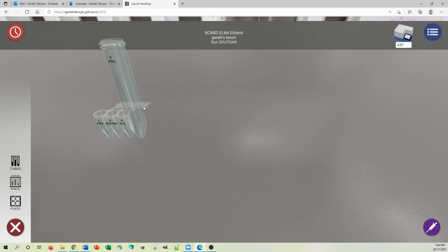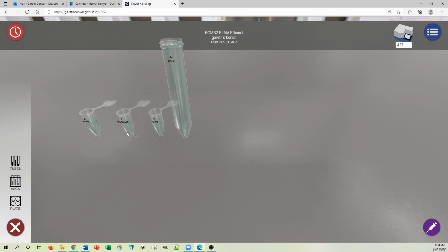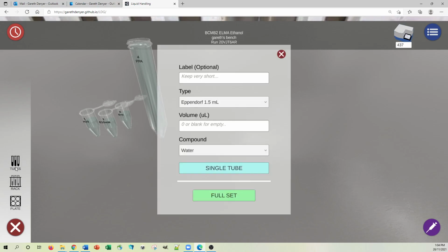can generate a full set of tubes containing the phosphate phenol aminoantipyrine buffer, which basically has the chemical that will turn pink later on. They've got the enzyme mix, which is the ethanol oxidase and peroxidase that will make the colour. And of course, an ethanol standard and some water if they want it. Now they can, if they wish, generate some tubes to do some dilutions. So that would be possible.